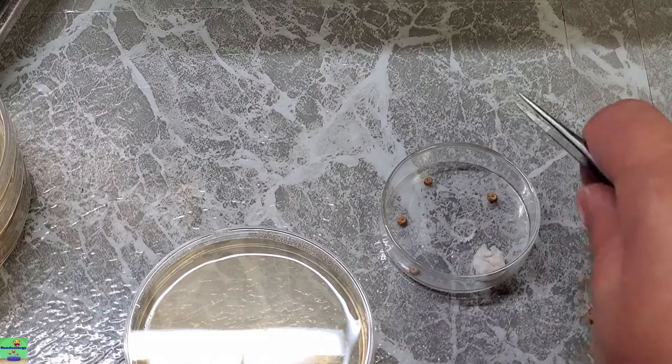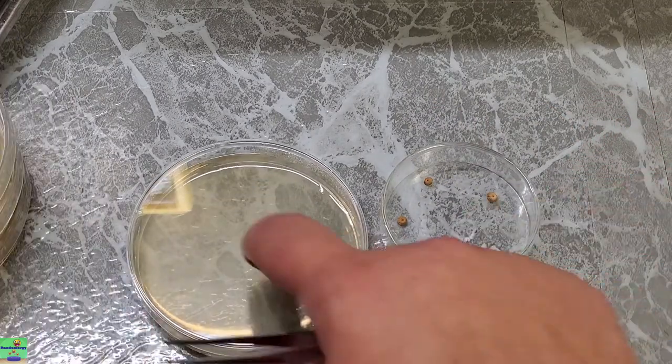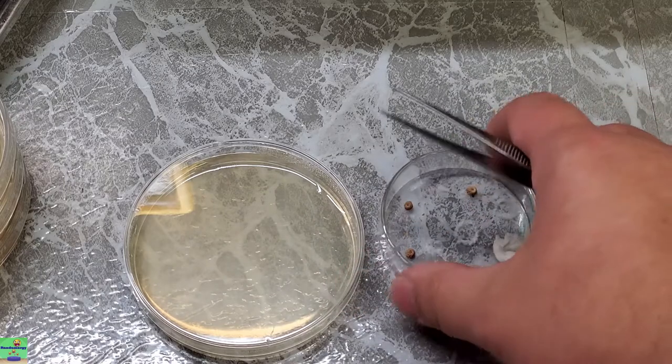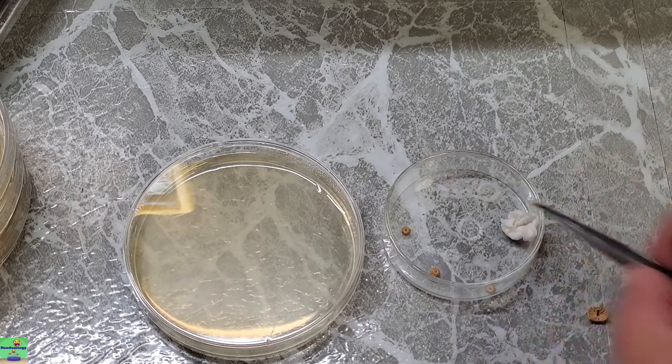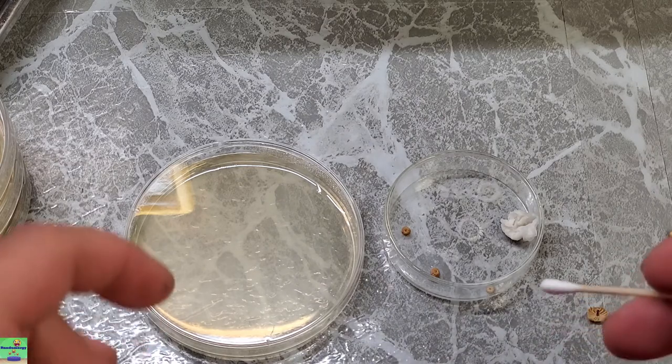The more you do, the better your chances of getting a successful culture are. Move that back up into frame. Okay. This one's pretty good right here. Now, obviously, you could do this with sterilized water and a syringe. You could make a spore syringe out of this and do it that way. But this is the down and dirty method, and it works pretty well. Most of the time, it does.